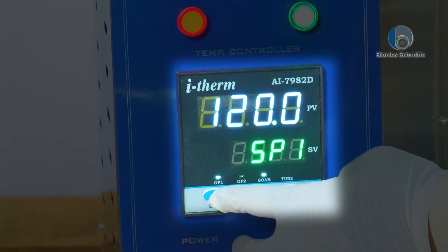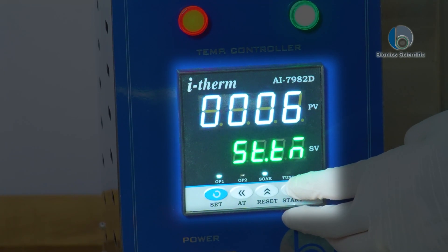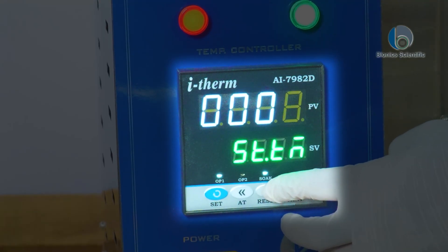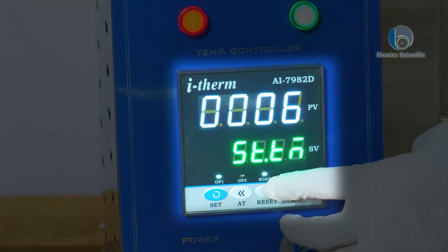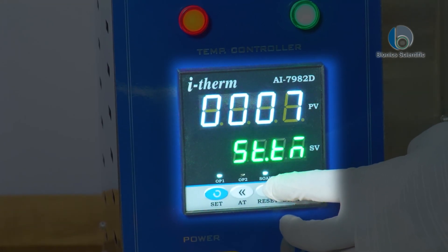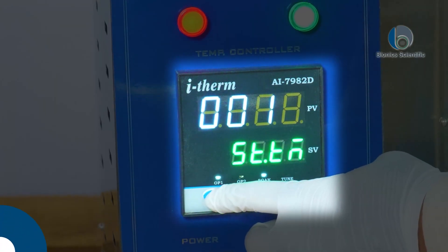I will press Enter, and now it is asking how many minutes or hours I should hold it. It is currently blinking on 6 minutes. I will adjust it — making it 5, 7, 8, 9, 10 — and then press Enter again to confirm.